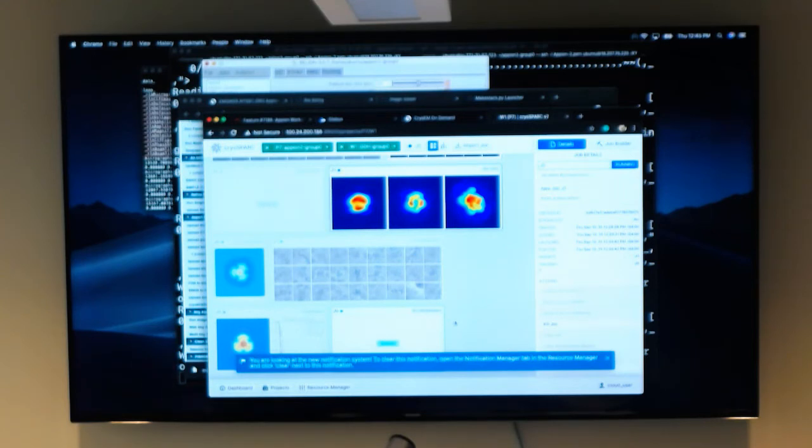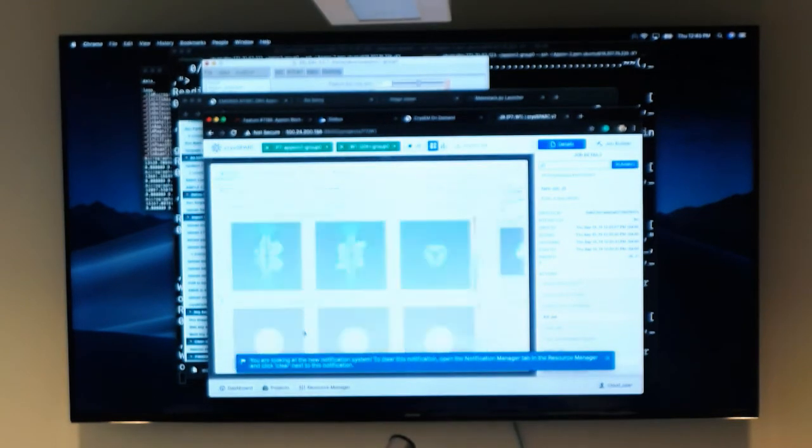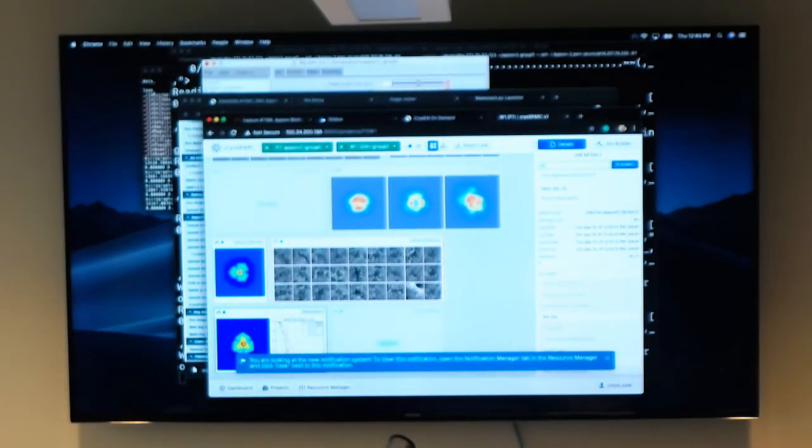Another reason why we're trying to do this is so you get not only familiar with the program, but also an expectation of the time frame for a job to complete. You can look at the specs on paper, but that might not correlate with the feel of processing. And in a very short period of time, I already have a 4-angstrom reconstruction here, right?